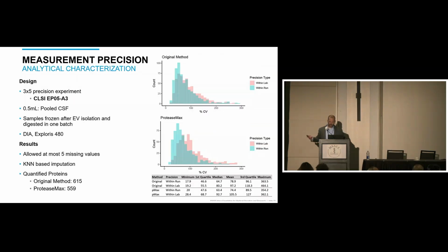One thing I failed to mention is there are 2 different types of imprecision you can assess, within lab and within run. If you've ever done this for assays in your lab, within run here would indicate 1 day of isolation, and within lab would indicate the several days of isolation. You're using a model to parse out the 2 different factors that contribute to the variability.